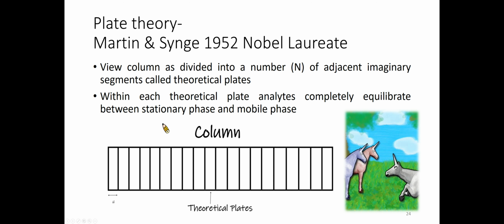It is important to remember that the plates do not really exist. They are a figment of the imagination that help us understand the processes at work in the column.